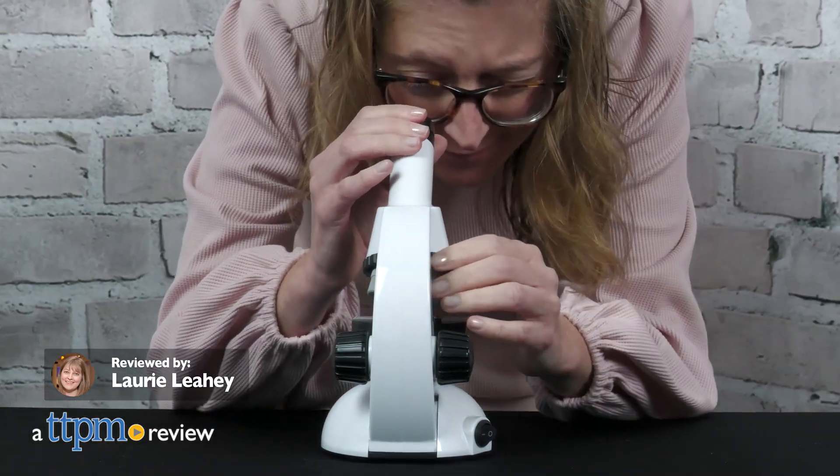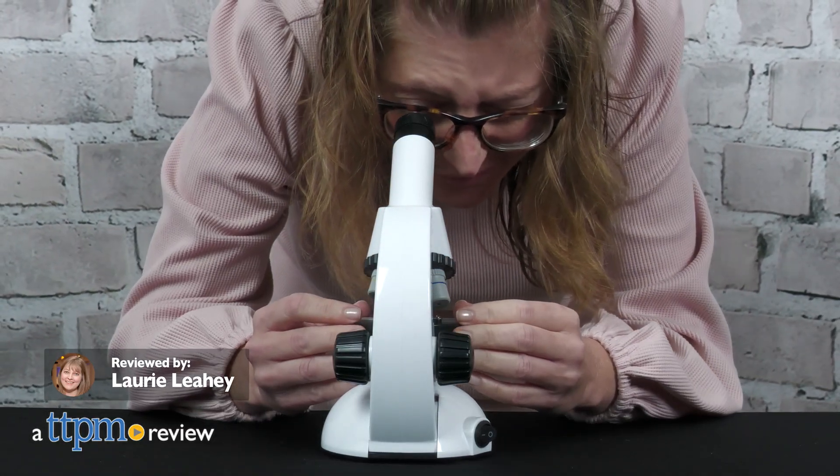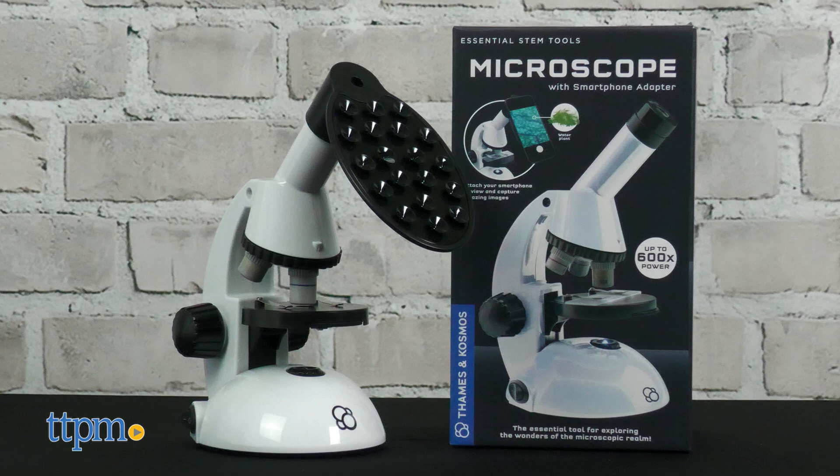If your budding scientist needs the essential tools for exploring the world around them, then they need the microscope with smartphone adapter. You can attach your smartphone to view and capture images.